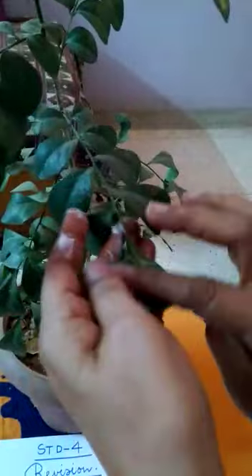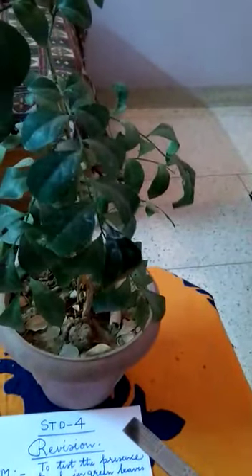And after adding and applying this to both parts of the leaf, it should be applied with this petroleum jelly, or you can say the moisturizer, whatever you have, and keep this potted plant for 24 hours in the sunlight. And after putting it, again we should pluck this leaf and another leaf too, and we should go through the experiment.